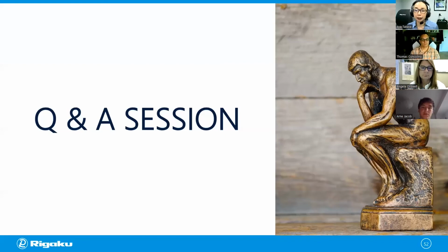So increasing the scan time doesn't automatically increase the resolution. It's more like when you increase the resolution, you don't have a choice but to increase the scan time. I hope that makes sense. And if not, you can type in more questions or follow-up questions. Yep, type in another question, Roger, if that doesn't address it, okay?